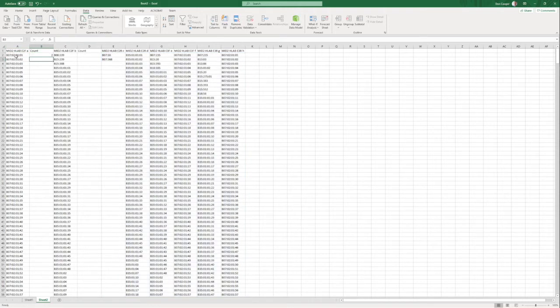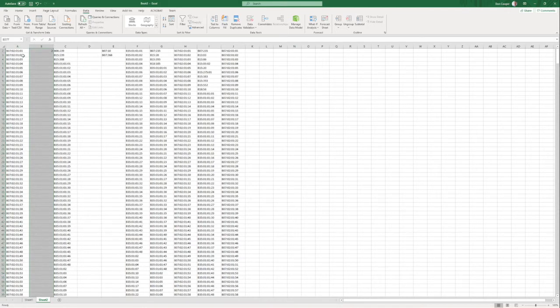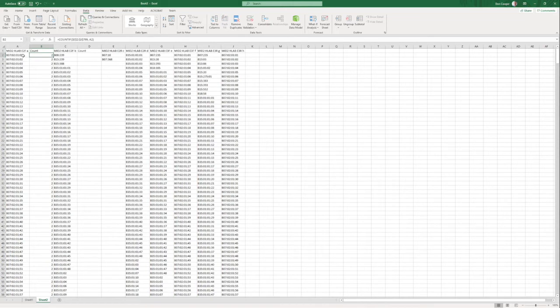So you see it occurred two times, and so it's probably not the allele that we're looking for. And then all we're going to do is copy and paste that formula across the whole column. And then again copy the formula into this column.